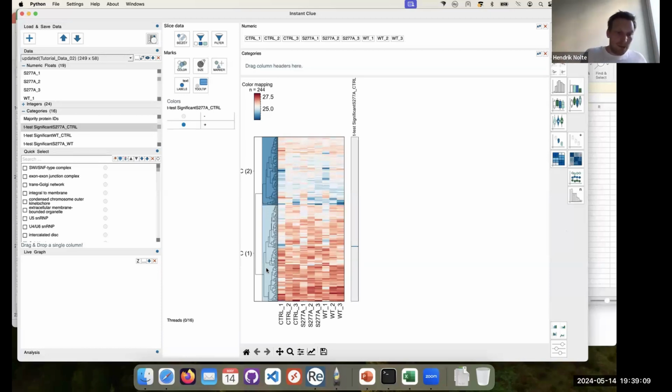As I said before, I usually recommend plotting a subset of all the data in a heat map. Now we have a small one and it's okay, but for larger ones, it's good to do this filtering before, let's say, a p-value cutoff of an ANOVA or so, and then you plot all the ones that are significant. You can use this color encoding for everything.